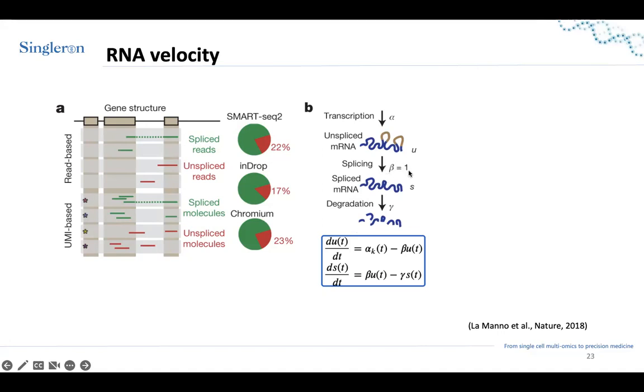Okay, but there are other RNA velocity methods where they include the beta parameter, not being 1, and also consider it as gene dependent as well. So then I would say, yes, we should consider these parameters depending on whether the RNA is coding or non-coding. But this is the limitation of the method, these assumptions. We also need to take this into account.